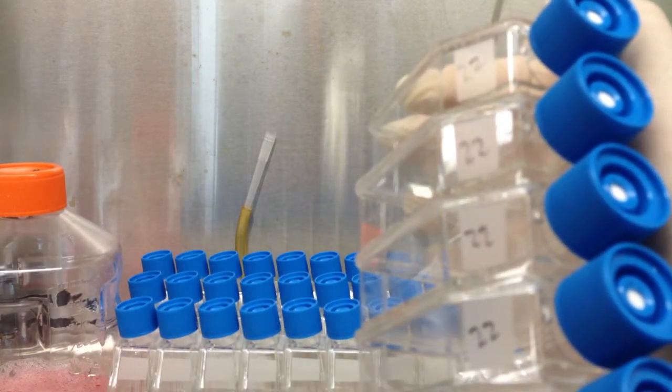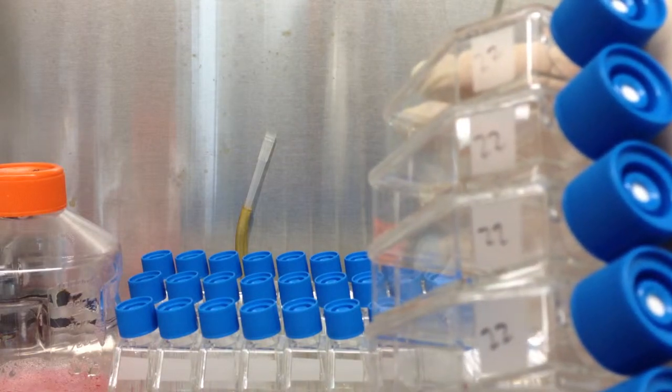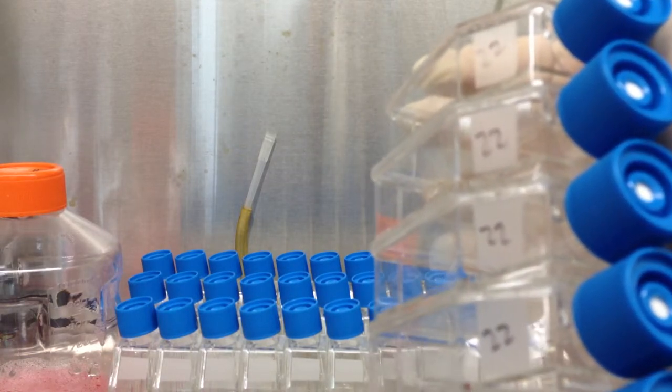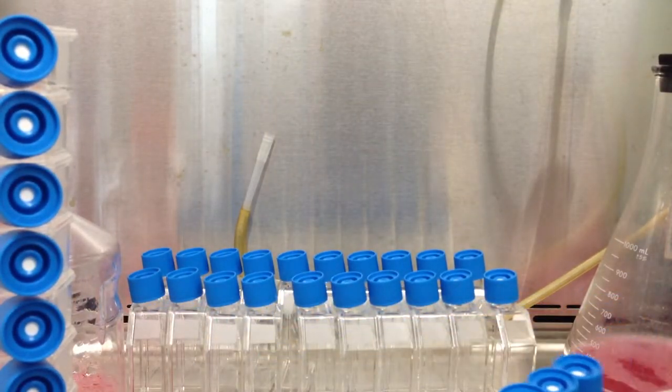And the cell should be fine. I also stood them upright to prevent them from adhering to forming a monolayer. It takes them a while, so there's not as much of a rush as to deactivate them the first time.